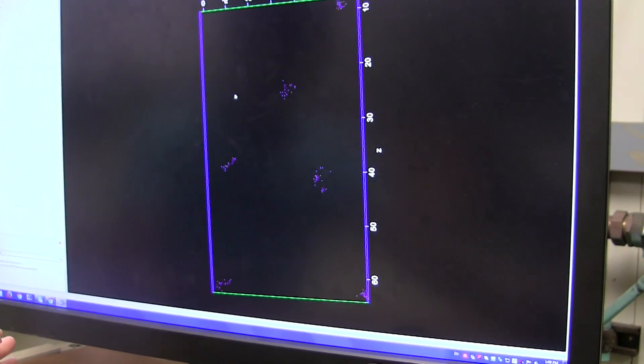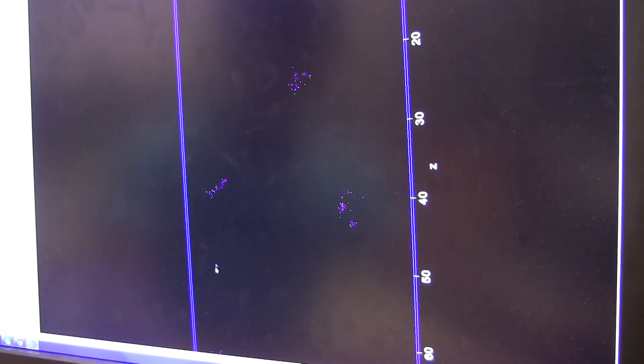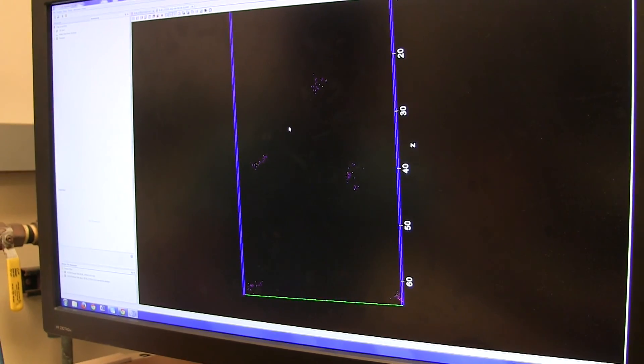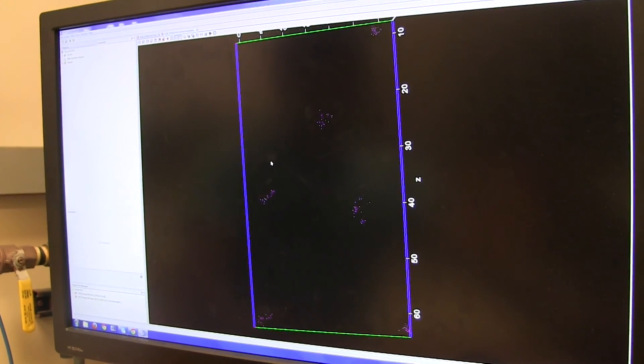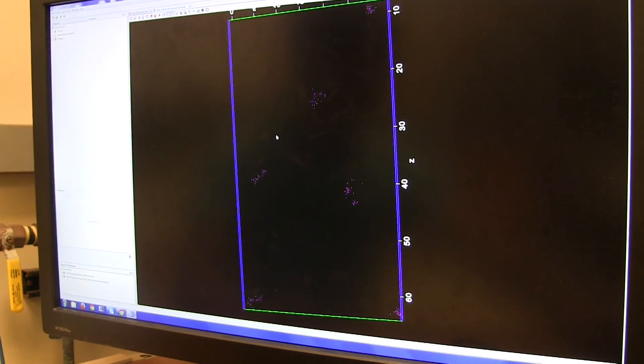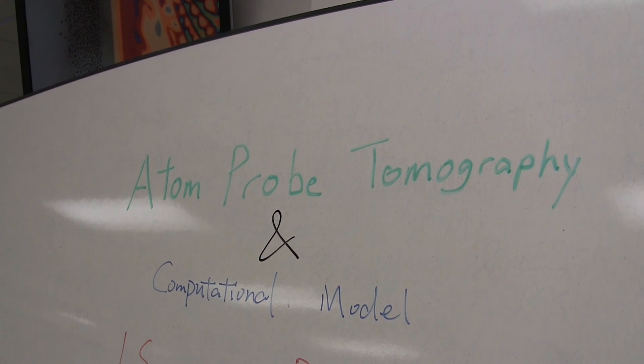So this is the exact same tip as before, but now we're only focusing on the clusters. And we can see that the different colors here represent different atoms or different elements within the clusters. So the purple is magnesium, blue is neodymium, yellow is yttrium, so on and so forth. And so atom probe tomography allows us to see different structures and characterize specific materials on the atomic level, which is something that's really unique to atom probe tomography.